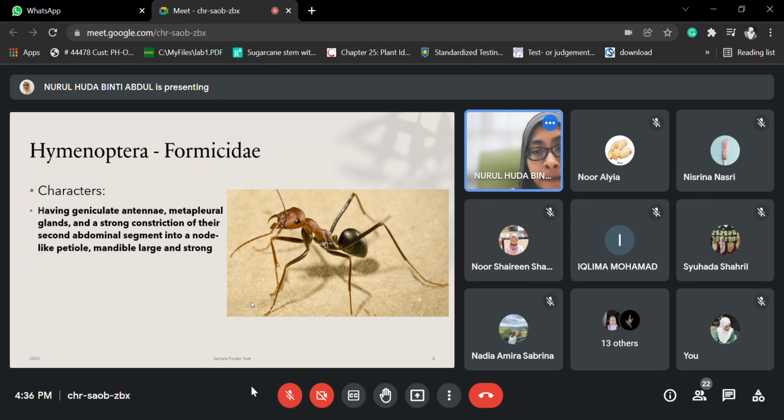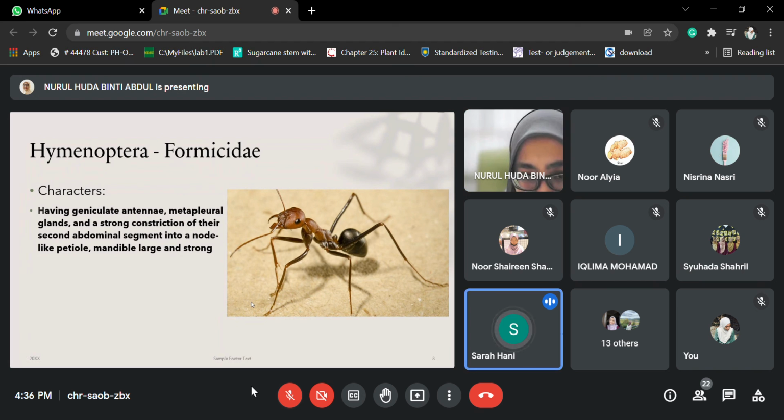Other than that? Slender thorax. Okay, well, if we can say it's slender, yes, it is compared to long and wide. Panjang dan lebar tu, of course, it's more slender, but it's not only on the prothorax. It's actually involved juga other types of thorax, which is pro, meso and metathorax. So of course dia nampak macam slender.